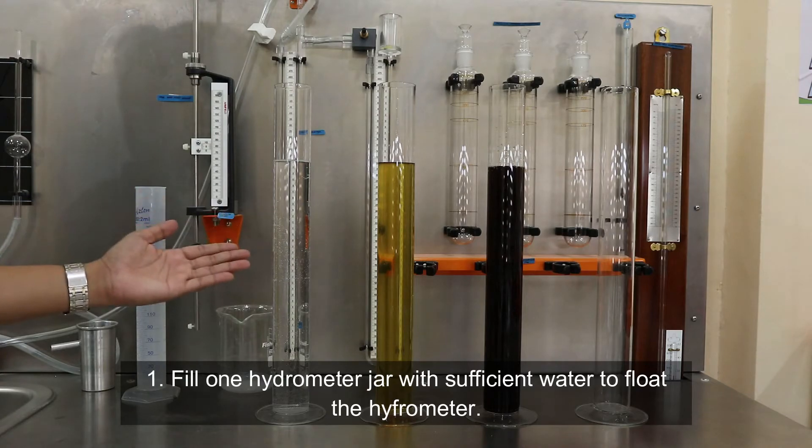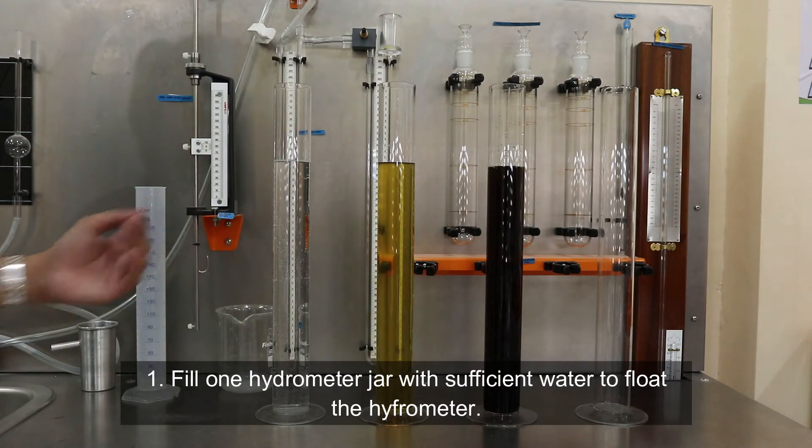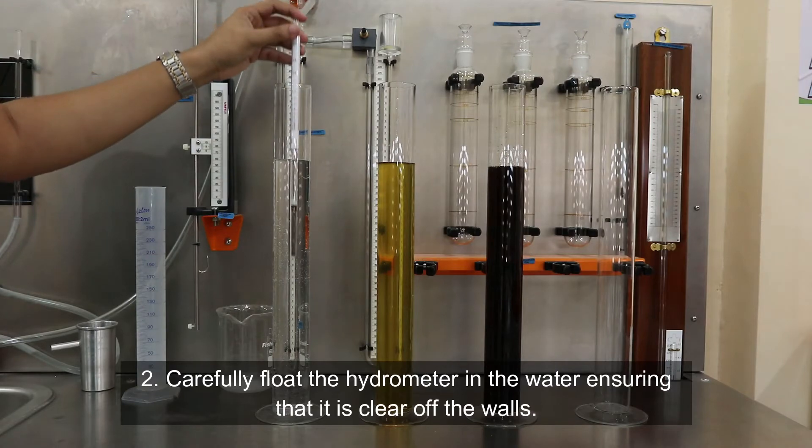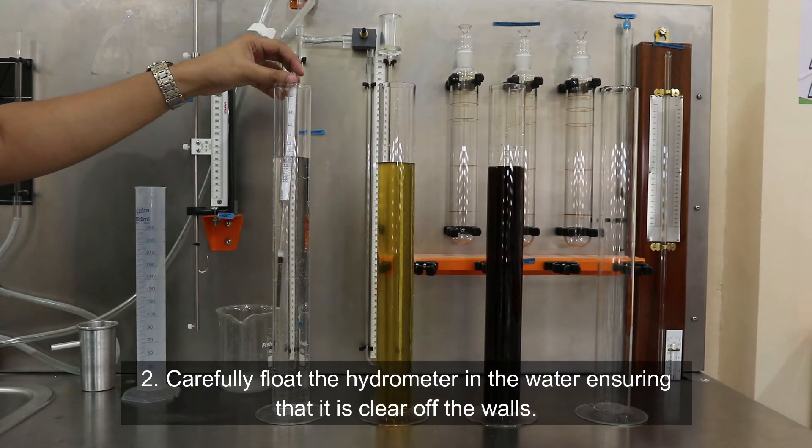First, fill one hydrometer jar with sufficient water to float the hydrometer. Second, carefully float the hydrometer in the water ensuring that it is clear off the walls.